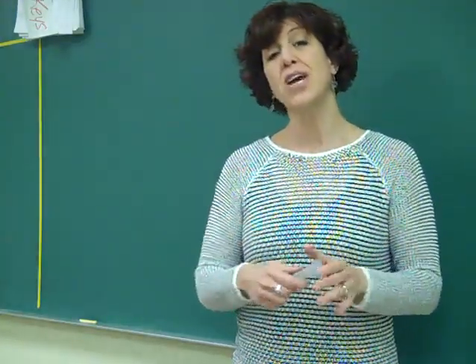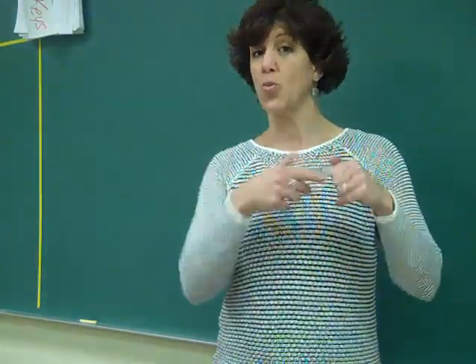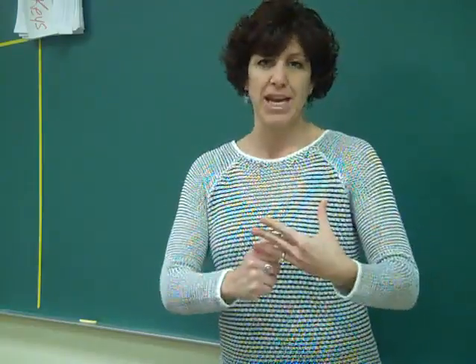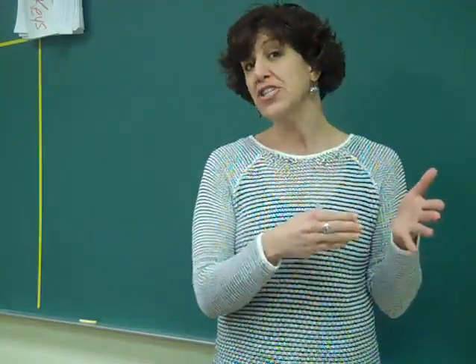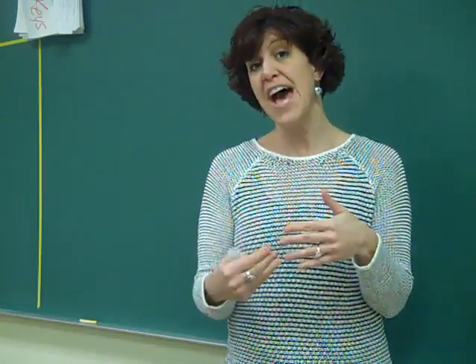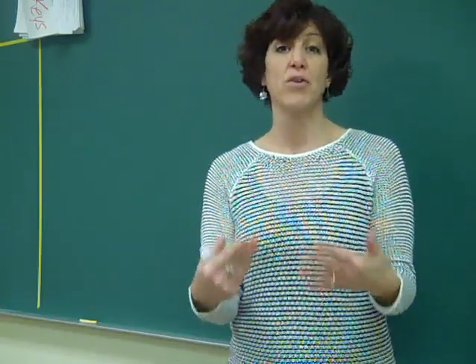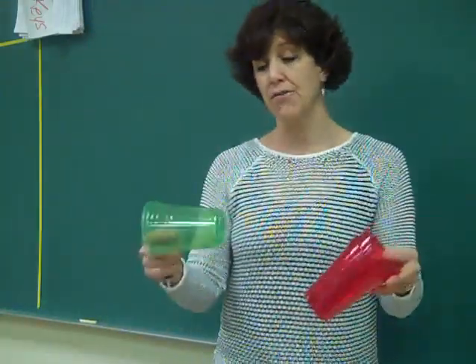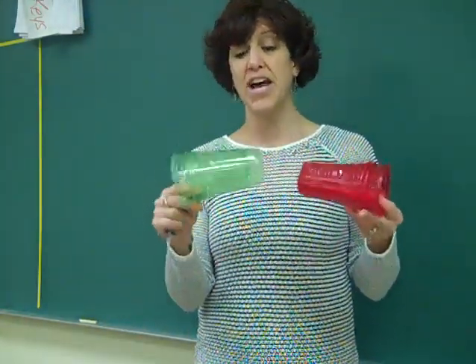So over time, you're actually going to be able to calculate the rate of photosynthesis by the amount of floating discs per minute. Under different conditions, hopefully we should be able to see the effect that those conditions have on the rates of photosynthesis. Then I want you to design one yourself. You could try different colors of light.